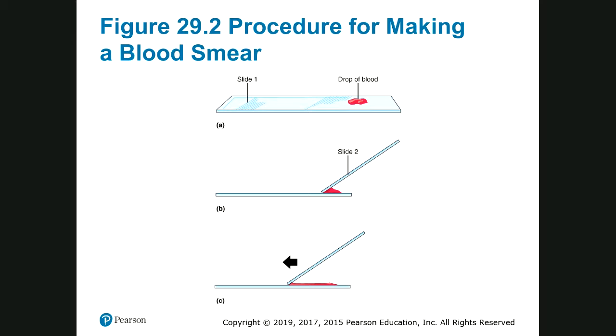And you have to take care of where you put the trash: specific glass trash, anything biohazard goes in red trash, and anything like a cover slip has its own specific trash. You have to keep in mind that you are in the lab and you are going to follow the protocol of this lab for your own safety and the safety of others and your loved ones.